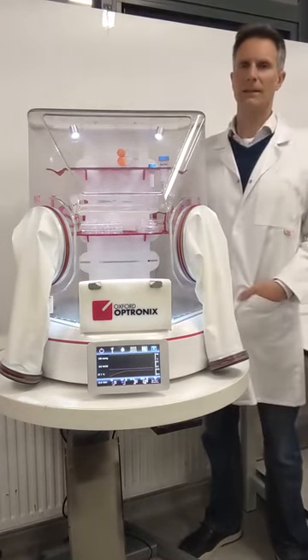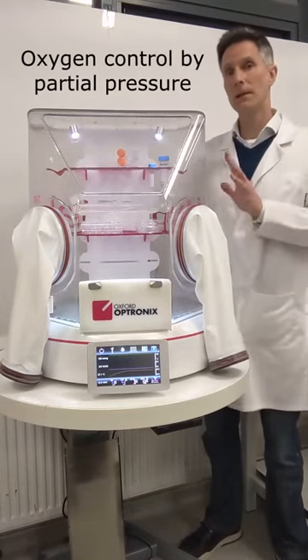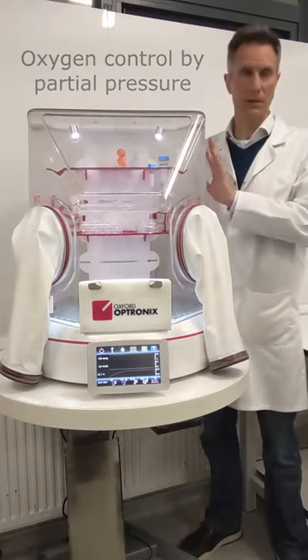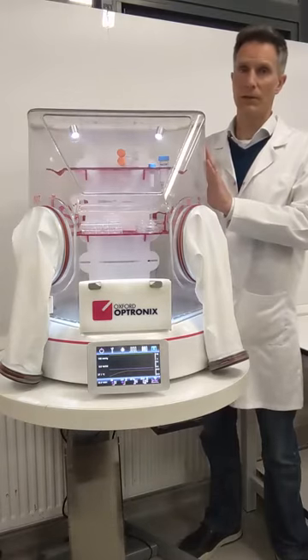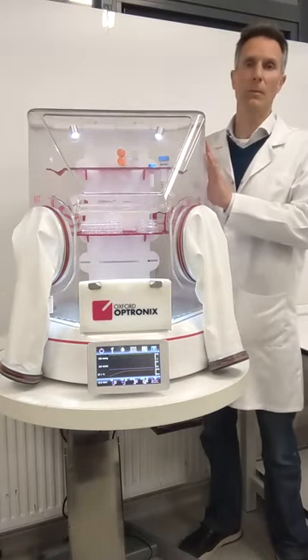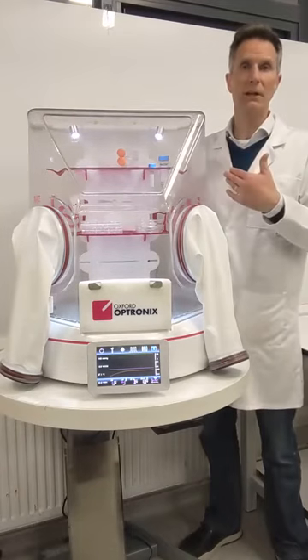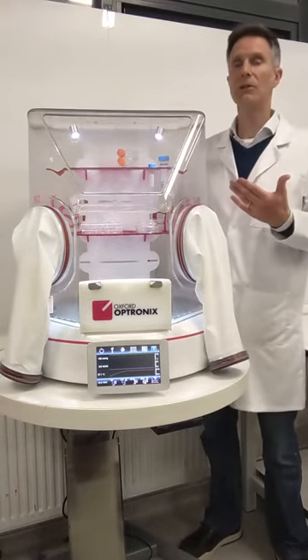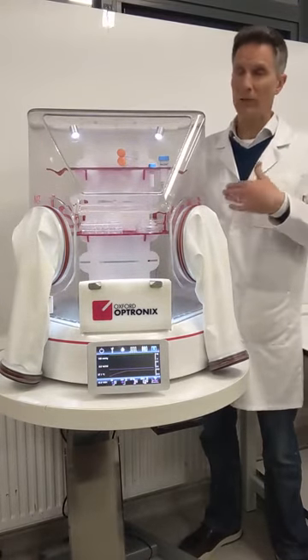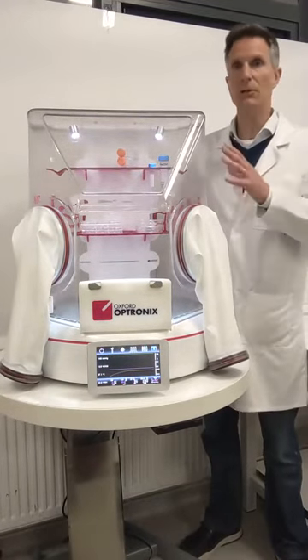And secondly, the HypoxyLab uses the partial pressure of oxygen to maintain its internal environment. That is a significantly different approach to the industry standard that utilizes a measurement of percent oxygen only. And the primary benefit of using a partial pressure approach is the fact that it is a more scientifically rigorous approach, since it intrinsically corrects for atmospheric pressure variability, as well as, in fact, the specific altitude of the laboratory using the system.